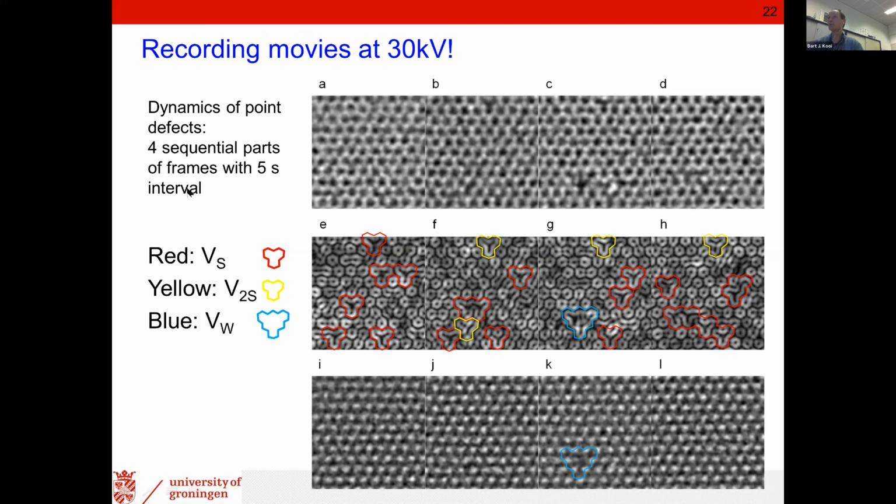in today's pixelated detectors with 4D ptychography. This is really a focus of much research around the world, to get the best imaging out of scanning transmission electron microscopy using pixelated detectors.